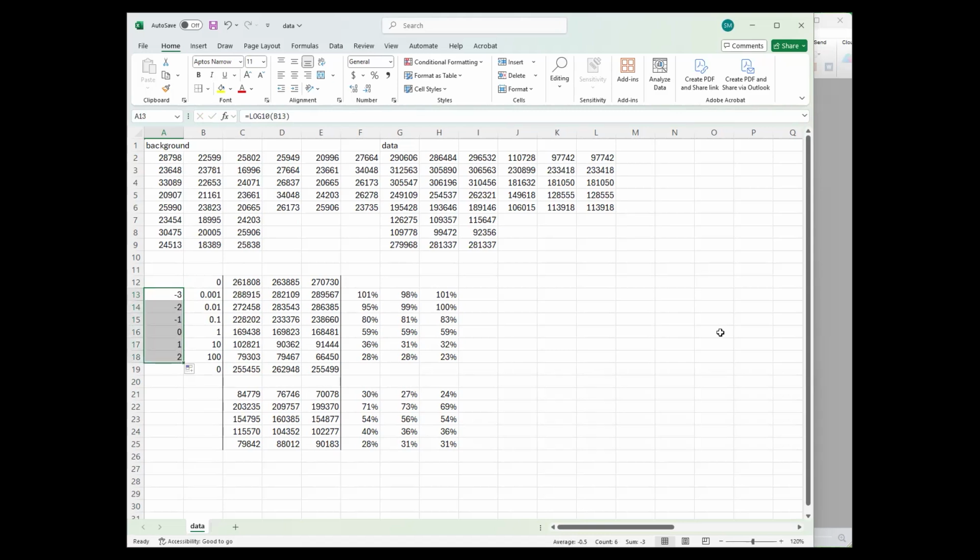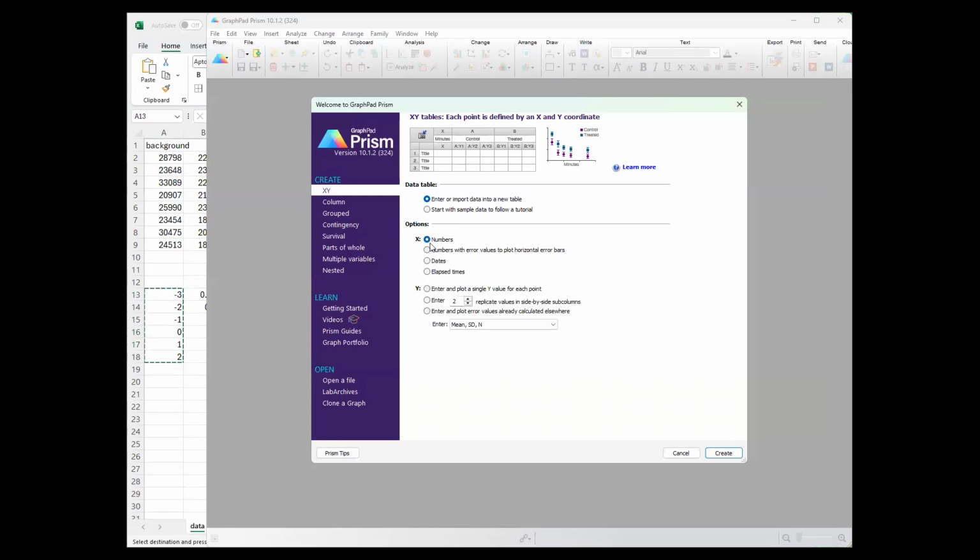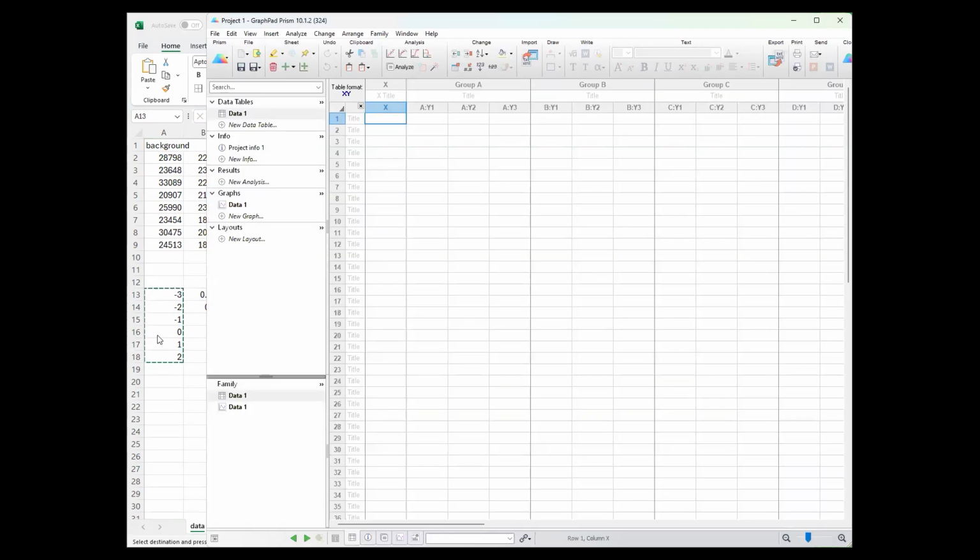And I'm going to start with the easy way to do this, which is to use GraphPad. So let's get GraphPad set up first. So you open GraphPad Prism. I love this program. It makes data analysis so simple. Your X value is just numbers, your Y is replicates, this is your percent. We have 3 replicates in this example, so I'm going to create my spreadsheet.